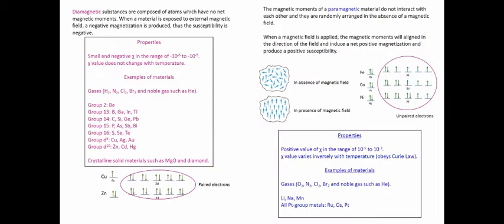Paramagnetic properties are given by at least one unpaired electron present in a metal center. At least one unpaired electron will give a positive magnetic susceptibility value. The more unpaired electrons found in a metal center, the higher the magnetic susceptibility value.